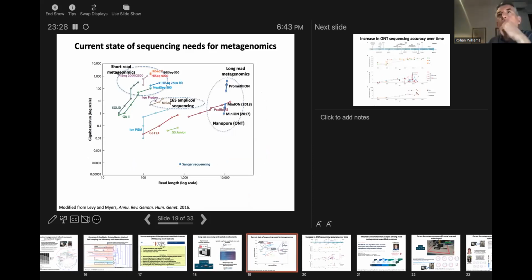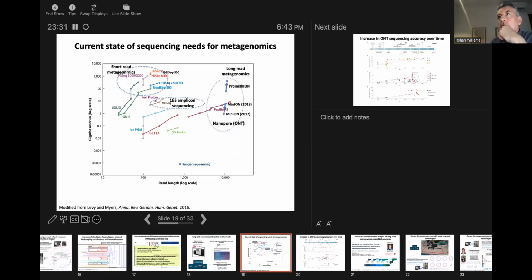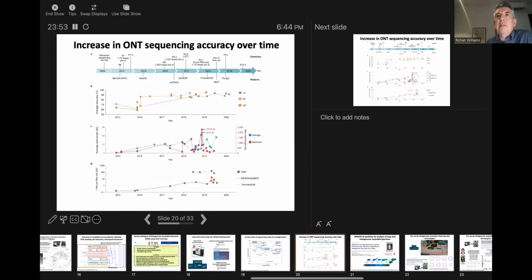And what we're really aiming to do is get up here. So this is read length. This is like 10,000 base pairs per read of DNA. And we really want to get up into this region where we're generating a lot of these kinds of reads. And if we could get there, then at least we start to have a chance of reconstructing large amounts of genomic material from these communities.